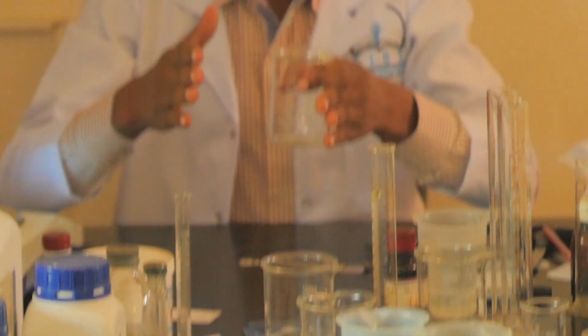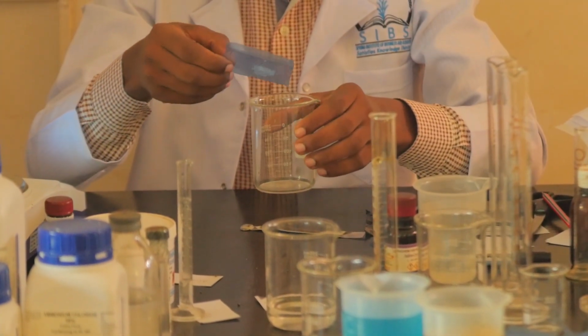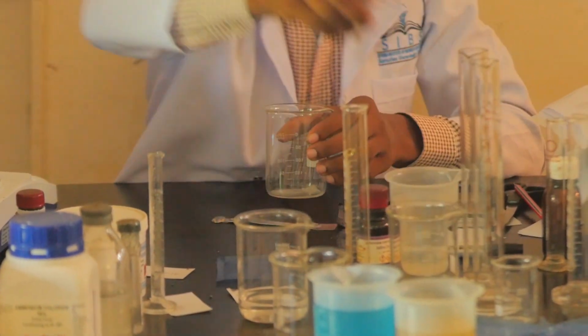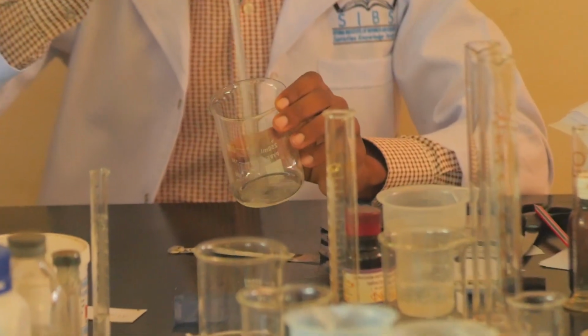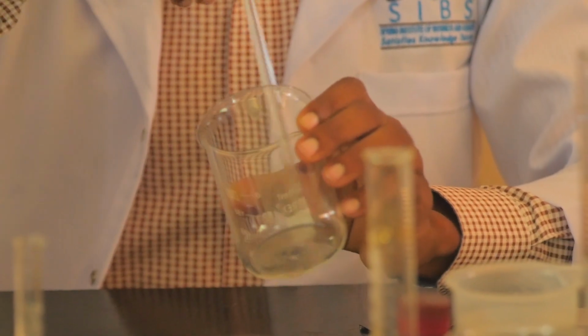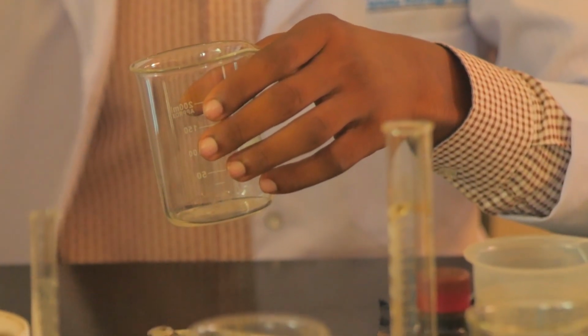Remember, iodine doesn't dissolve in water, so we are going to make first the potassium iodide solution, which will help us to dissolve iodine crystals. So take 0.5 grams of potassium iodide and dissolve in 0.5 mils of water. Using my stirring rod, I'm going to stir gently to make this solution so it dissolves quickly.